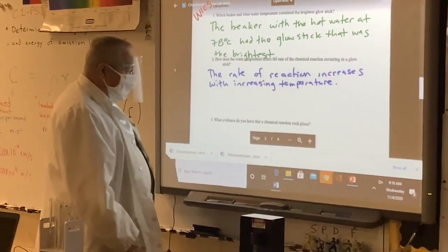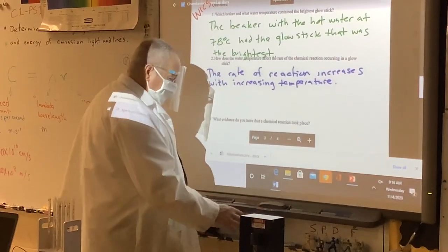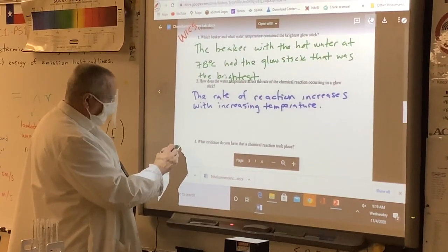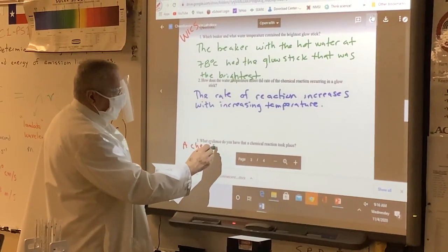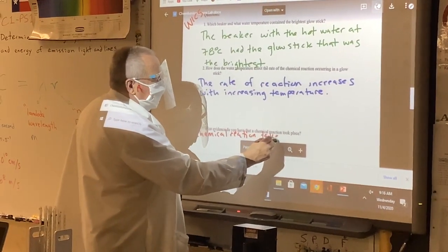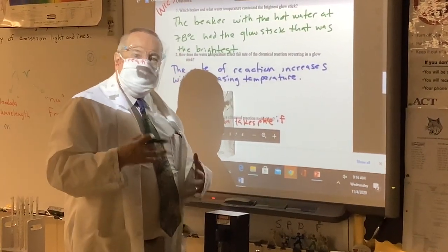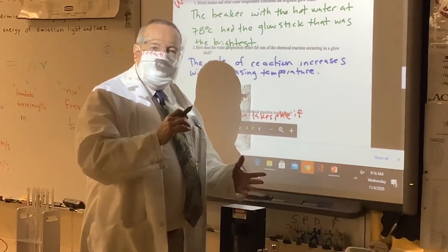And the last one is, what evidence do you have that a chemical reaction took place? I'm going to write down here: a chemical reaction takes place if... There are certain ways to tell without having molecular vision to see if bonds are broken and made.